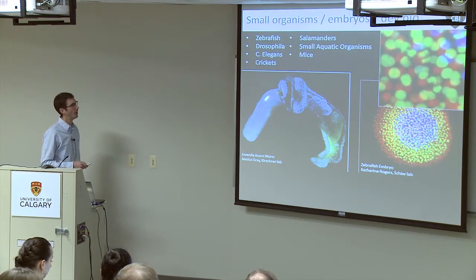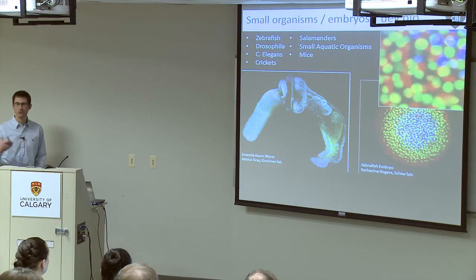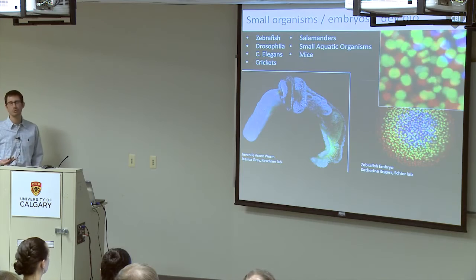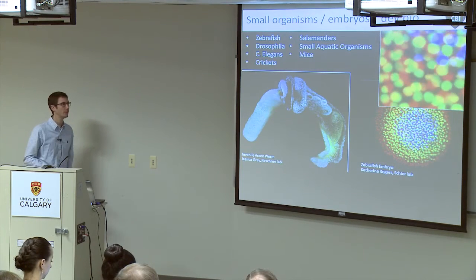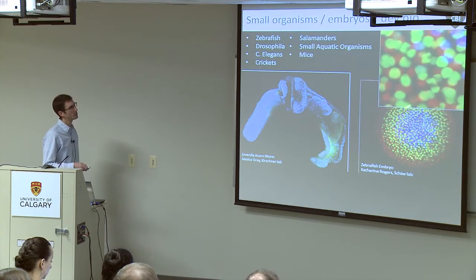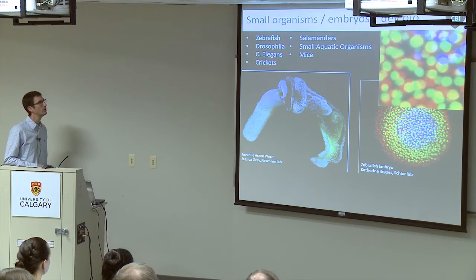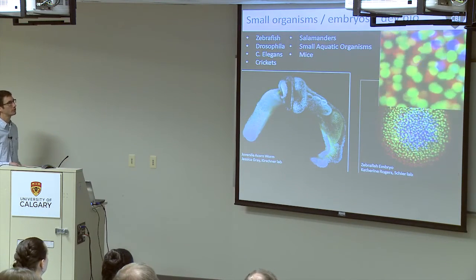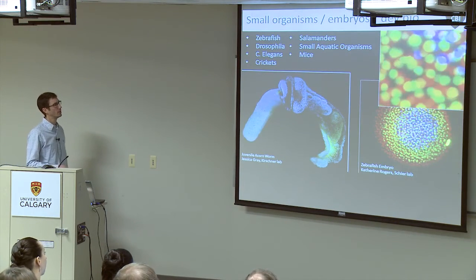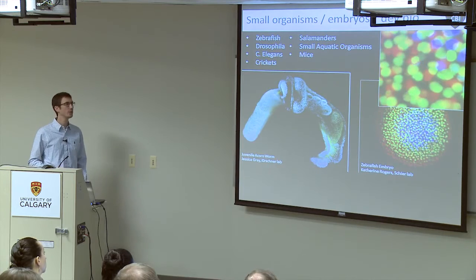So we're using the Zeiss system, the Multiview type design, and this is what it was primarily designed for, developmental biology. So the sample on the right here is just a really early zebrafish embryo. This is imaged just from a single angle. This wasn't actually even a multi-view image. And this was imaged every 30 seconds for about 20 minutes.